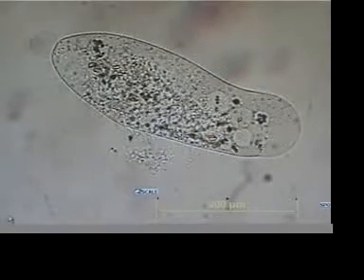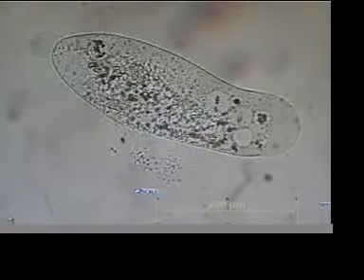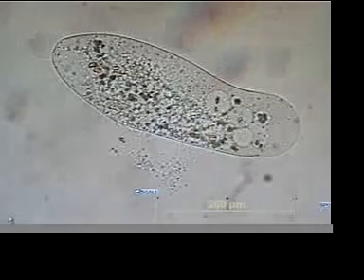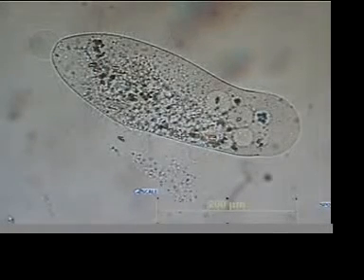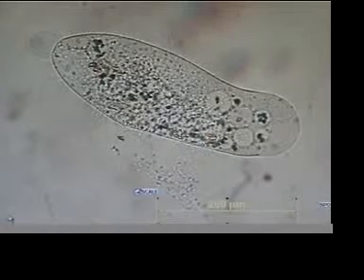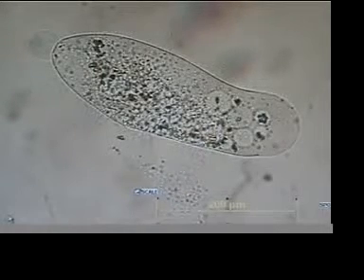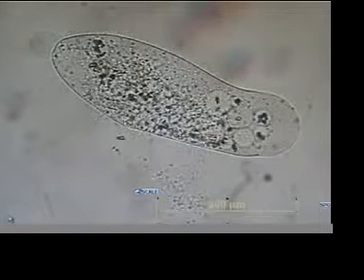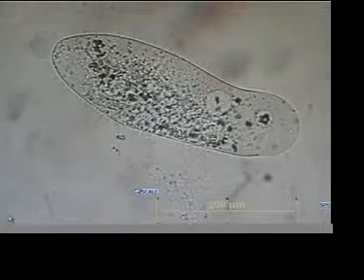And I think we just had something burst on the bottom. The organism thinks they're coming out. A little burst of material came out. Maybe you can see those colors now, which are caused by using the DIC filter. Still internal changes happening.